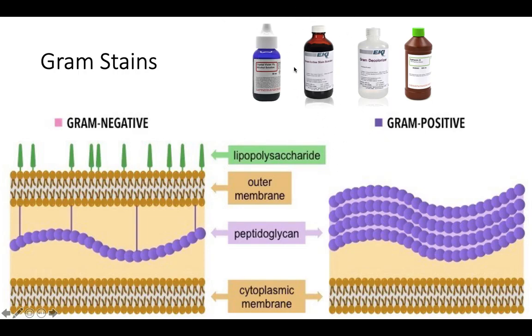Now, gram's iodine and crystal violet, when they come in contact with one another, stick to each other like a magnet. They bond. They form a rather large crystal violet iodine complex, a big giant molecule called a mordant, which is just a chemistry word for big large molecule. So you pour the iodine on your slide, the gram-negatives and the gram-positives at the same time.